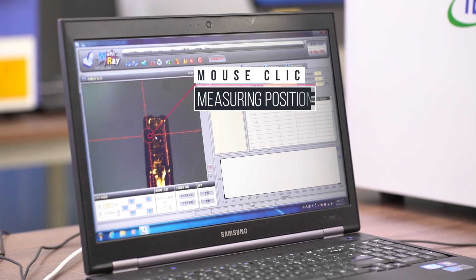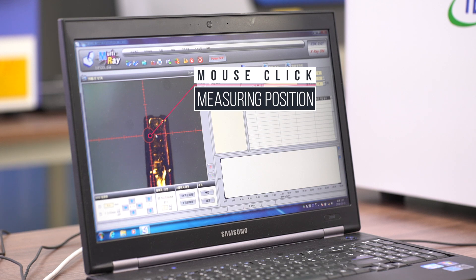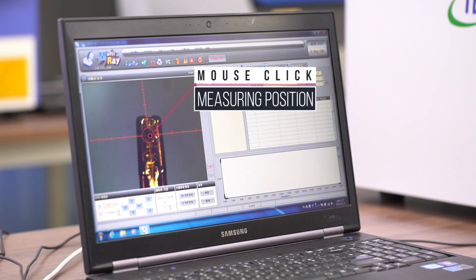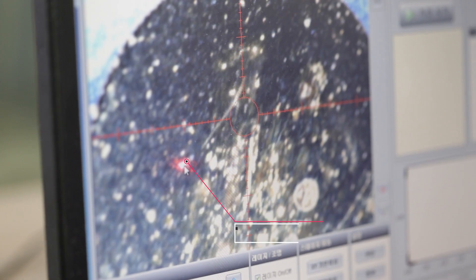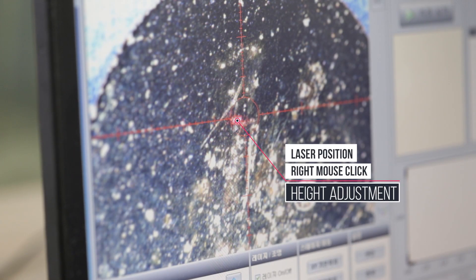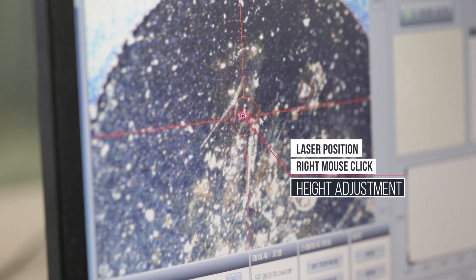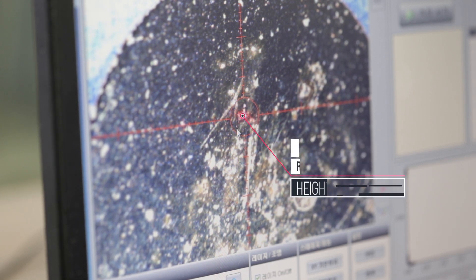Click to measure. Right click the laser point to measure the point. The measuring height will be adjusted.